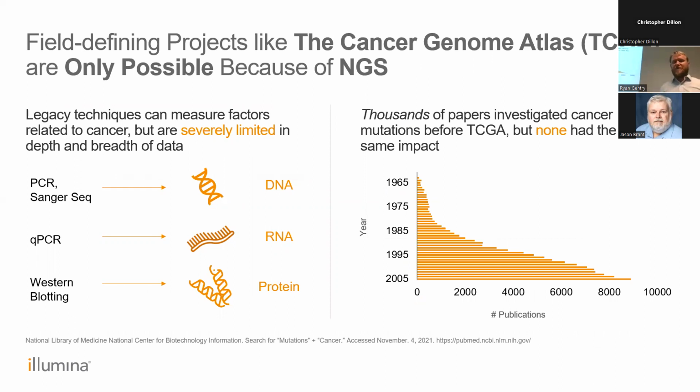One of the first ones to do that was the Cancer Genome Atlas, where they were able to profile DNAs and RNAs in cancer on a broad scale. You can do whole exome sequencing, whole genome sequencing to try to better understand these tumor types that we're looking at. That's the power of the sequencing: the scale of your project and the scale of what you're looking at.